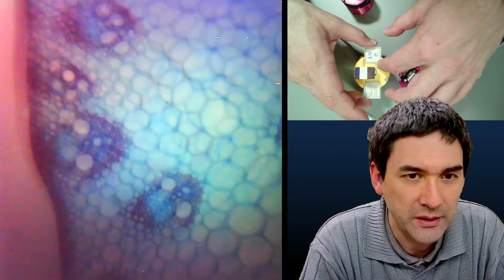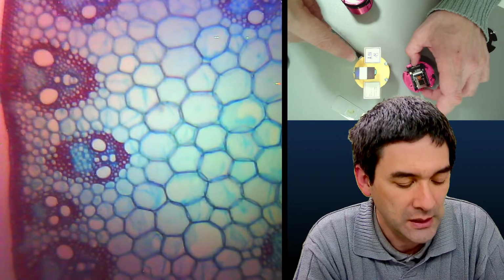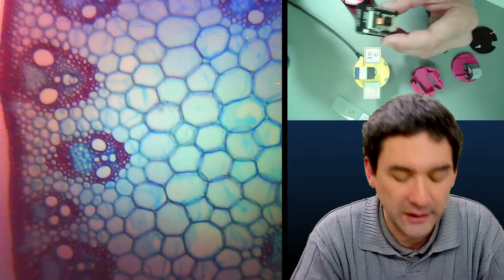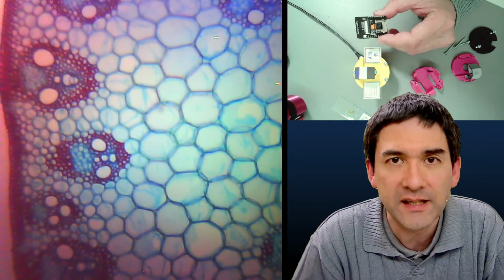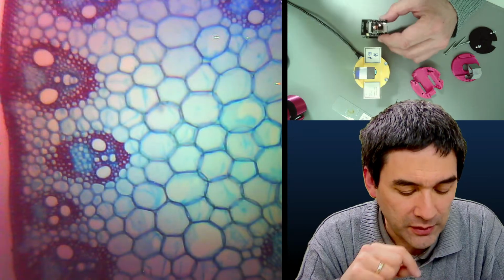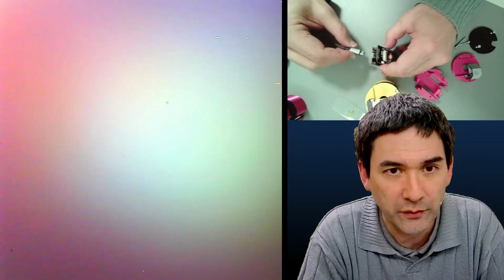What I'm going to do now is the following. And now we have to be a little bit patient. I'm going to disconnect this camera now, and I'm going to connect the camera module directly. This takes a couple of seconds because I have to reconnect wireless again. So I'm going to disconnect this here. Okay, and then I'm going to connect this one over here now.